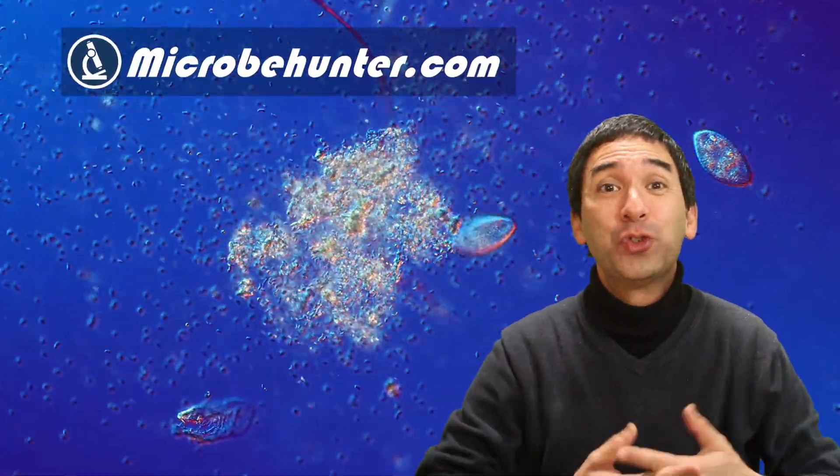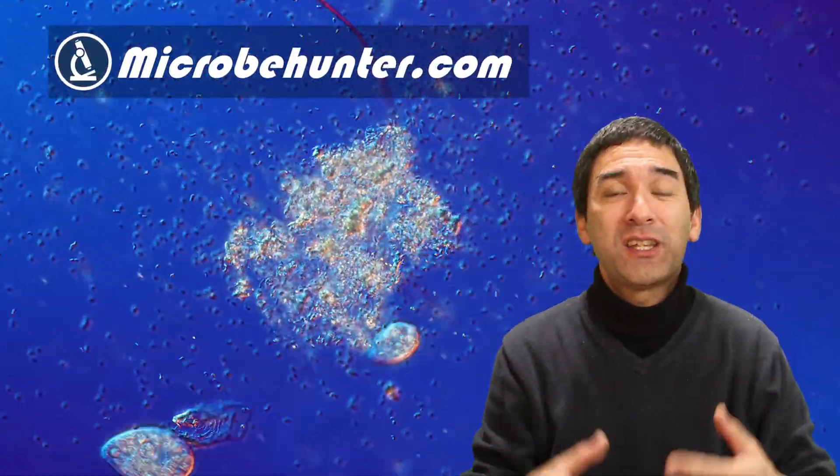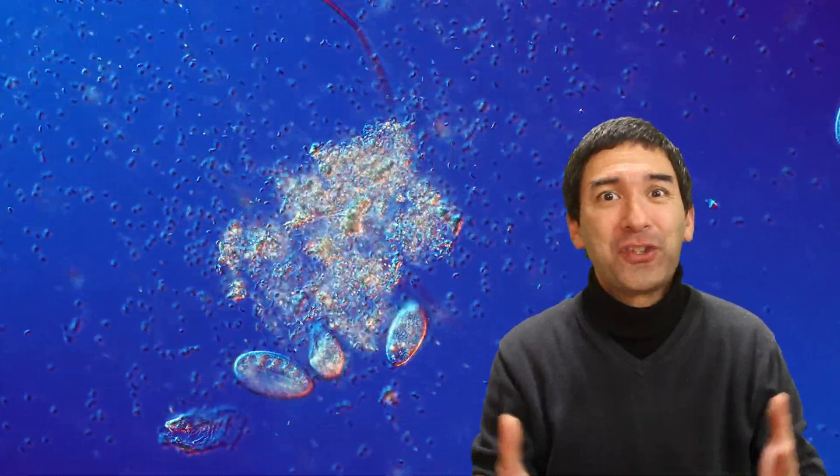Specifically, I would like to show you how ciliates, such as paramecium and vorticella, among others, how they are able to hunt for bacteria.